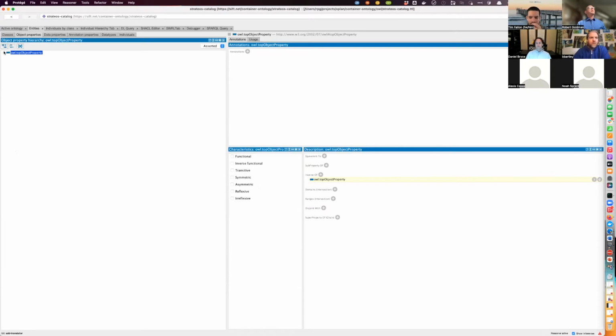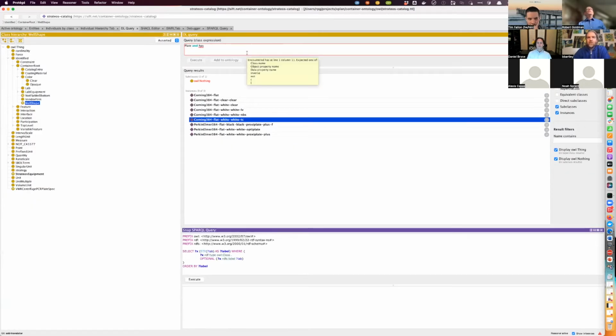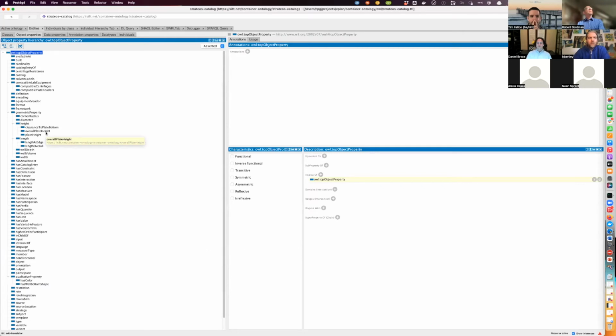So let's imagine I want to find a plate that is, you know, this.